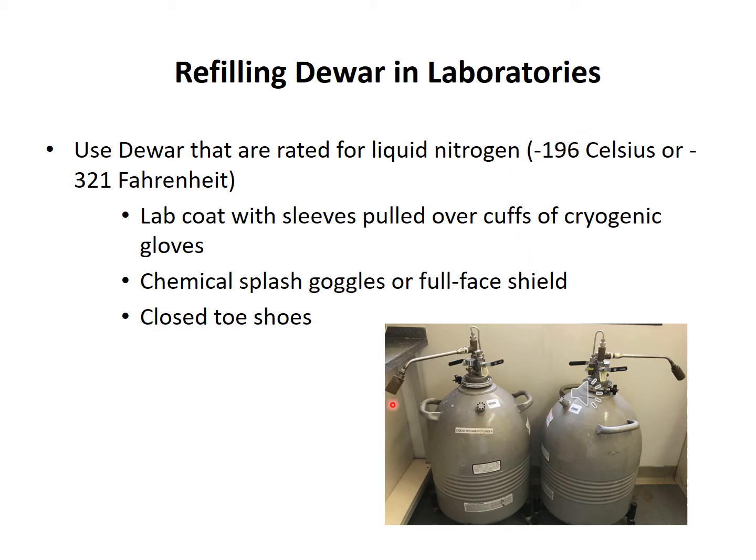Each lab contains this Dewar. For example, this is our stock, and individual students who need some liquid nitrogen have to transfer it from this big Dewar to a small bucket. We have special buckets or baskets that are resistant to this temperature.